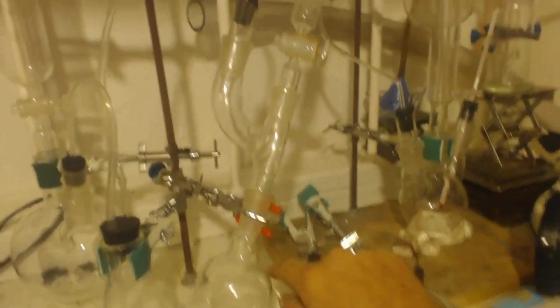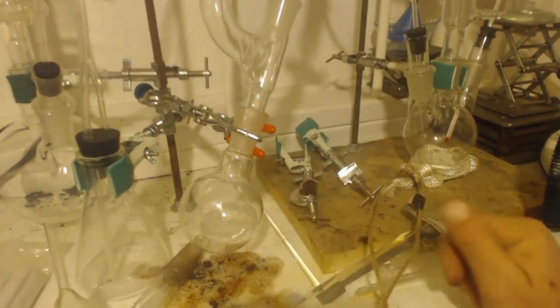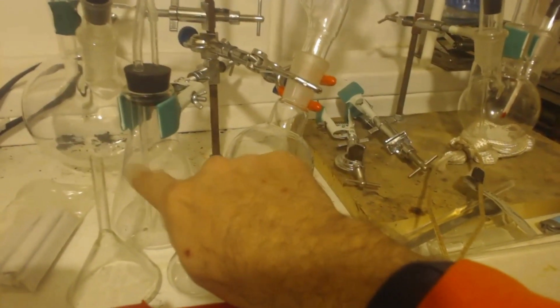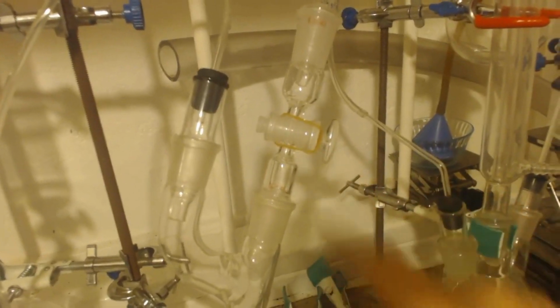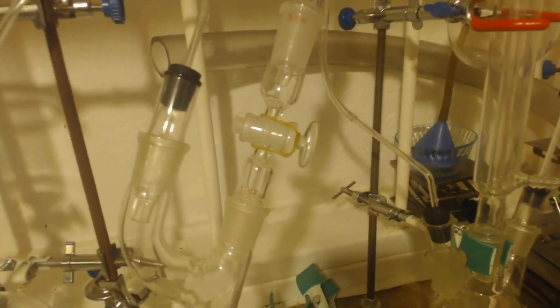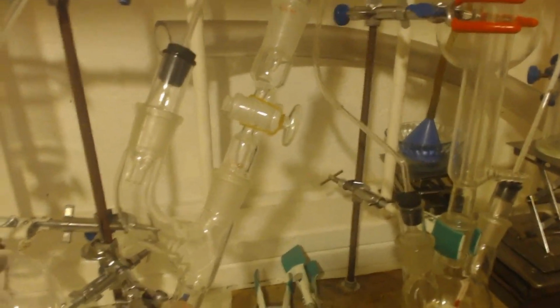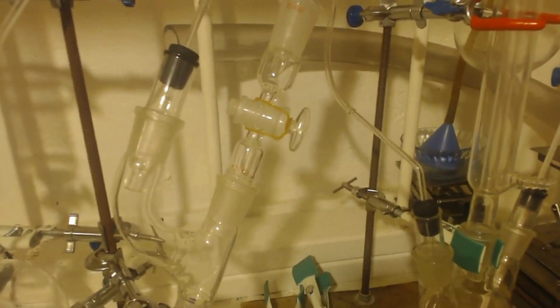Now this just goes to basically a suck back trap, okay? I want this before my actual reaction pot, in case I get any suck back, it'll go into here instead of the calcium chloride drying agent, right? So it comes out here, and basically, since it's a gas, it'll fill this up. But it goes out here, and I have a valve just in case I need to go get ice or go do something for 1 second or whatever, go to the bathroom or whatever. I can turn this off. Once the chlorine stops making it and I see it suck back, I can turn this off and then not have to worry about it.